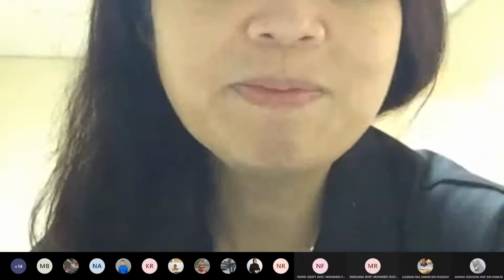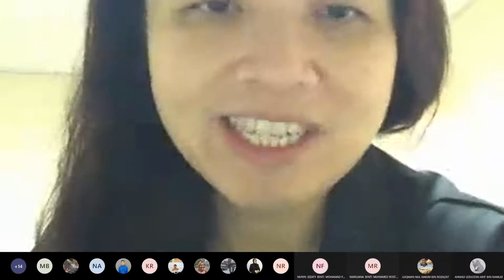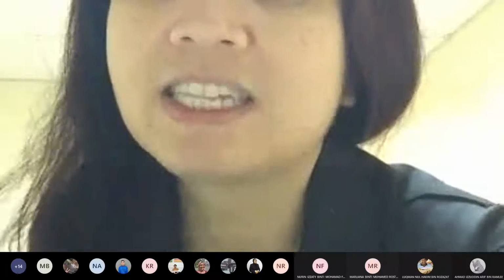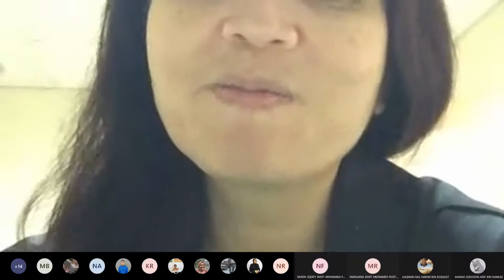Okay, so later I will go outside. It's a little bit noisy because the reaction lab is actually open air, not exactly open air, it has a roof, but it's a no aircon laboratory. It's quite noisy because it's open. So if you cannot really hear me, please tell me so that I can speak louder. Okay, I'm using an iPad actually, so it will keep moving. So you will feel like a real live demo when I bring you around.